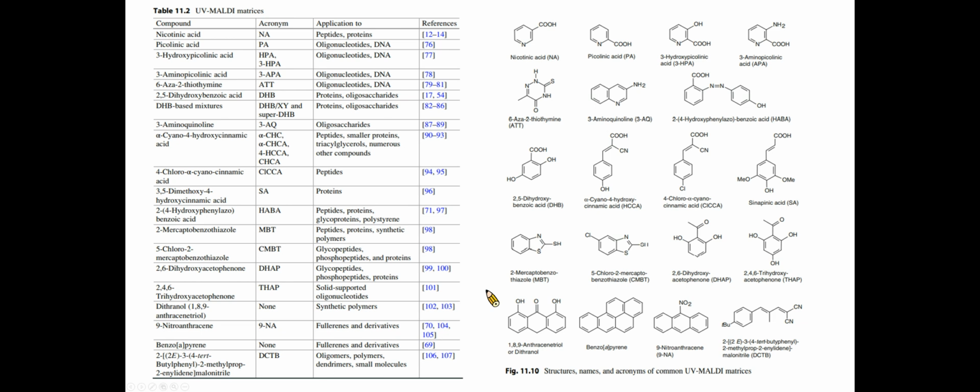In MALDI technology, the matrix has a special effect on the analysis of the sample. It dilutes the sample to dissociate the clustered macromolecules. It also protects the sample: the matrix absorbs the laser energy and then transfers it to the sample, avoiding direct laser irradiation of the sample that would lead to decomposition of the sample molecules.